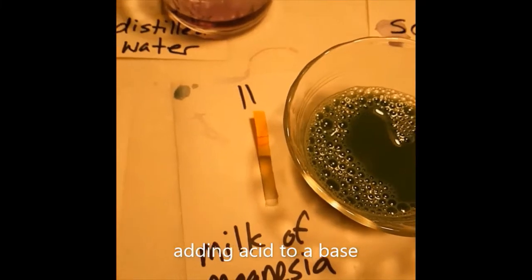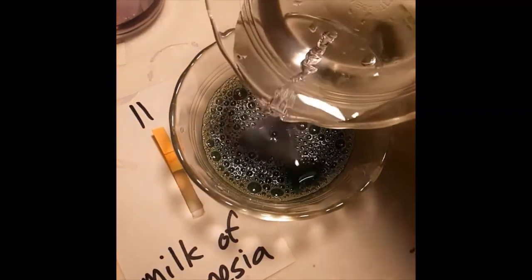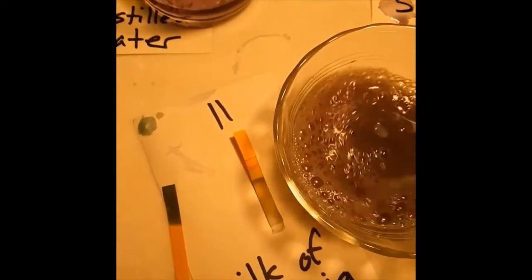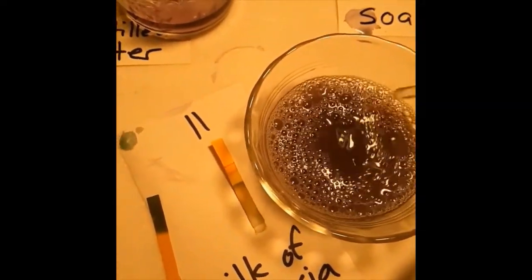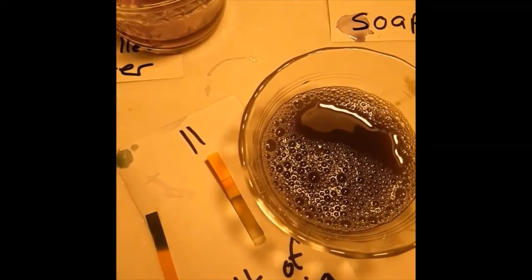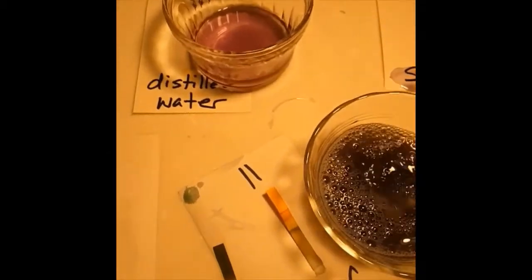This is going to take a lot of vinegar. Let's try more. So I'm going to add it big. We're going to go big, and see if we get anything. There we go. Purple. See if we can get to stay purple. There it is. I think that's it. I said that before though, didn't I? That might be it though. Oh, it's staying purple. It's staying purple, so we have gotten it to be neutral.